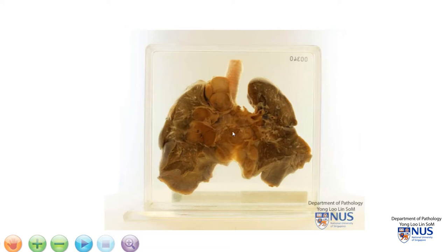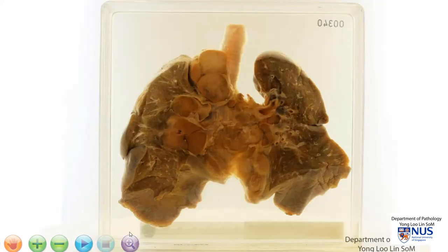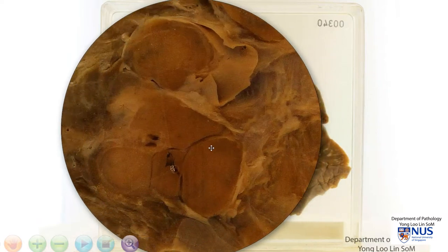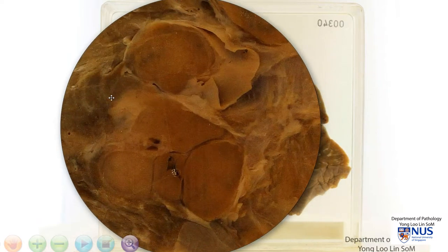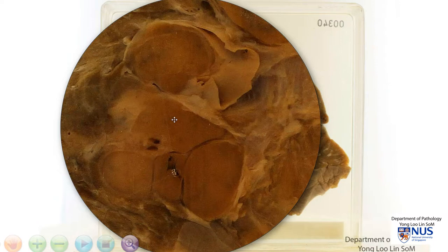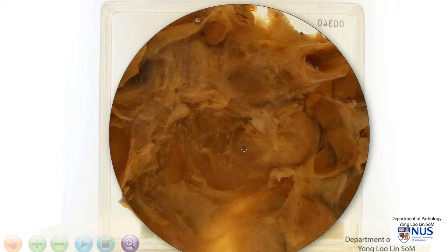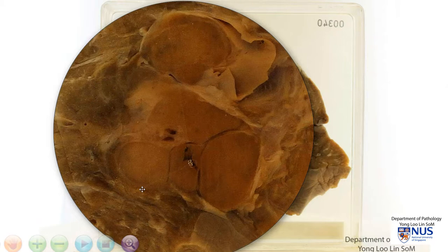Let's turn this around, and we can also see here a little bit more clearly the cut surface of the enlarged lymph nodes. Here is where they interface with the lung parenchyma, and we can see that the nodes are actually kind of adherent to one another, and hence they are matted. The cut surface looks pale and tan and shows a rather homogenous, what we call a fish-flesh appearance. We don't see any obvious areas of necrosis.